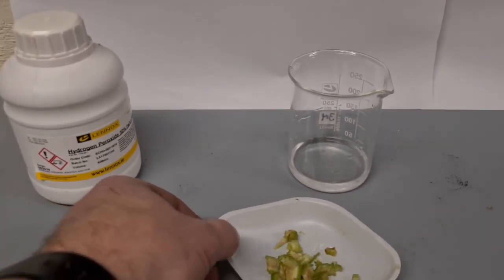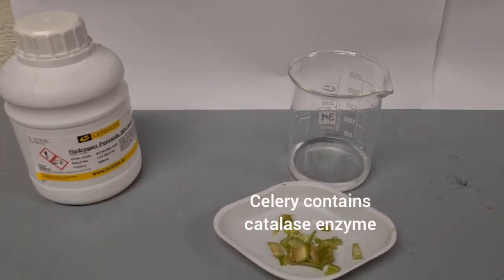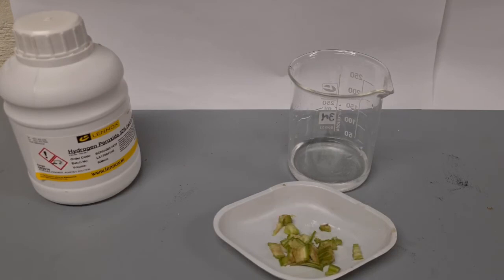We're going to use chopped up celery. It produces an enzyme called catalase which speeds up the breakdown of hydrogen peroxide as well.